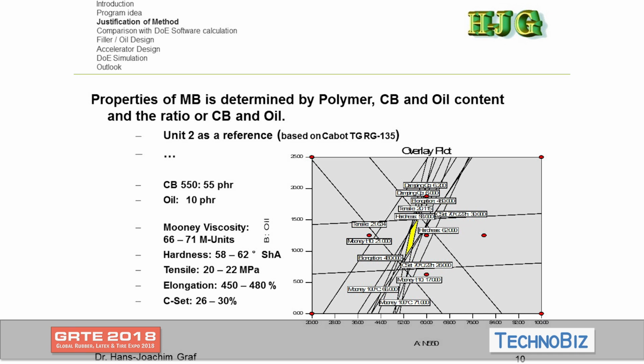If you go now further down and investigate almost all the properties you can measure on this compound, this chart represents here a type of, let me say, compounding window for this compound. And you see here in real that almost all properties you can measure are having a linear relationship to the ingredients.